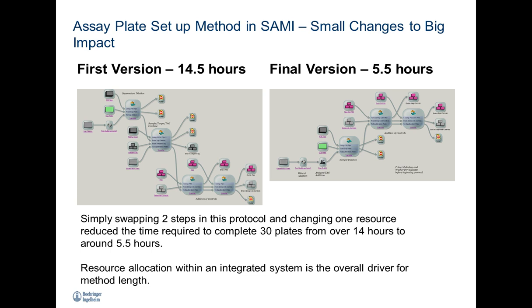The simple action of swapping 2 steps in the protocol, it was basically just order of reagent addition, which is irrelevant to this assay setup, brought the 14.5 hour time frame down to 5.5 hours, which was much more viable for what we were doing.